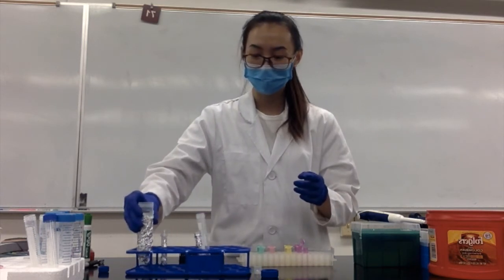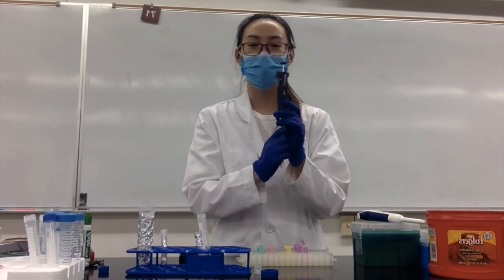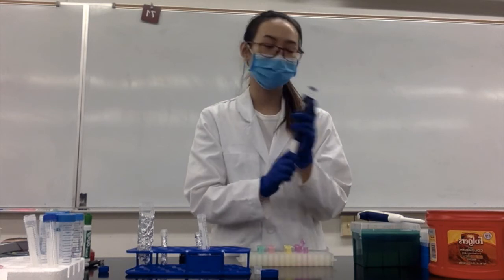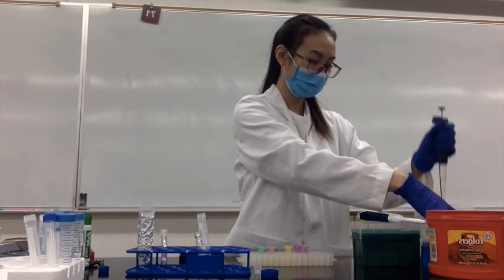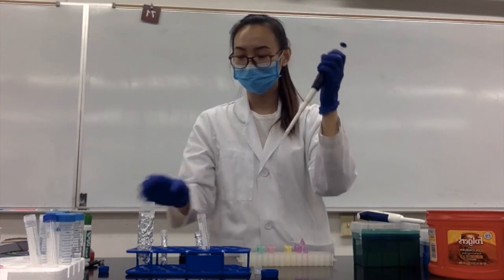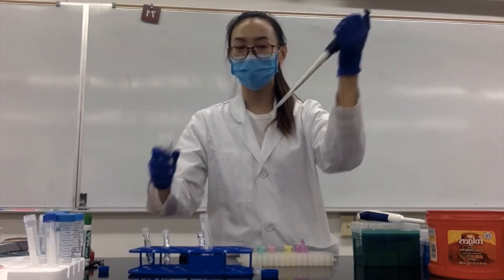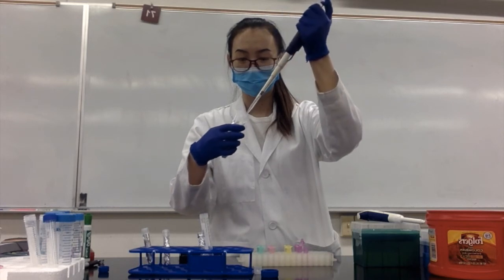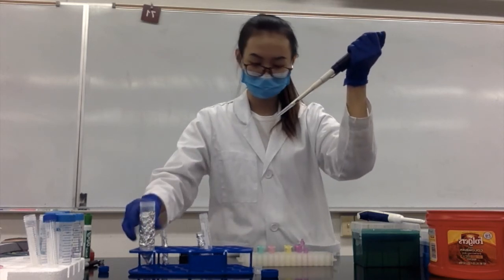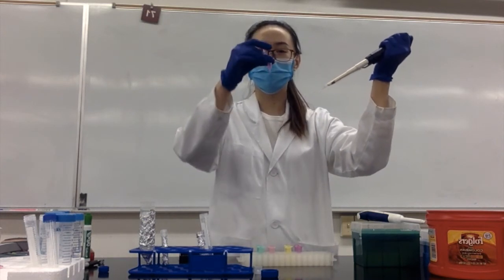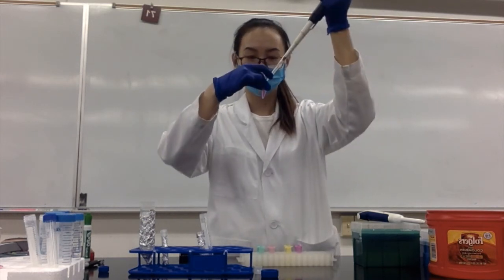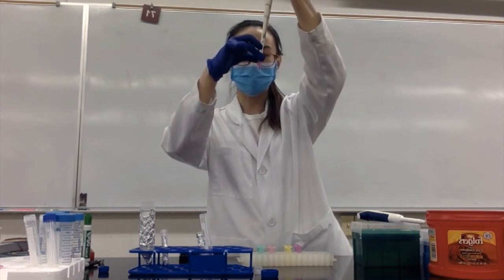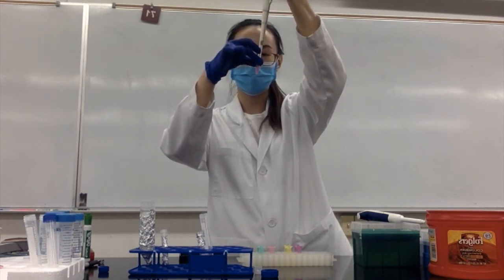Next, find another micropipette and set it to 1,000 microliters and get your tip. Then transfer 1,000 microliters of your DHE working solution to the cell tube, and pipette up and down 10 times.